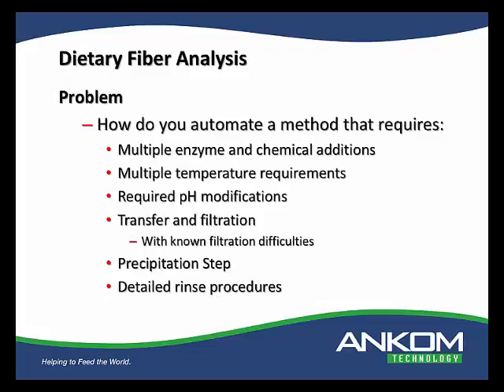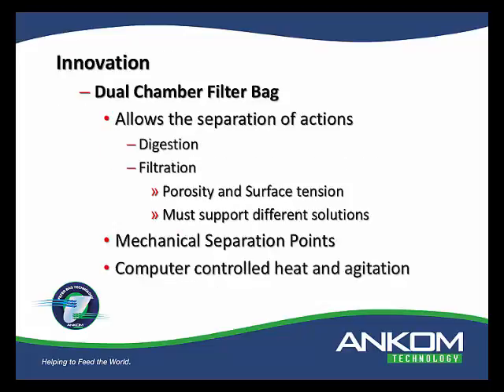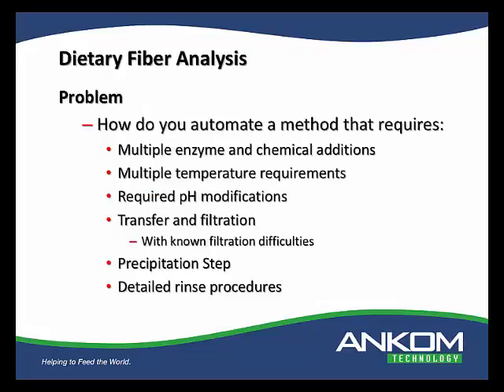So let me go a little bit into the background of the system and really how we designed it. I'm Chris Kelly, as Nick said before. When we looked at dietary fiber analysis, the question was, is this a process that we can automate? There clearly is a problem in the design process, and that is, how do you automate a method that requires so many different steps?